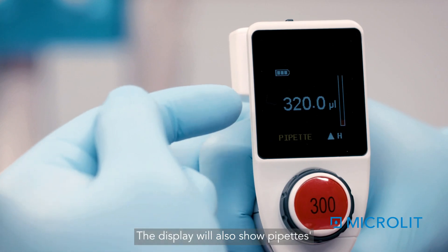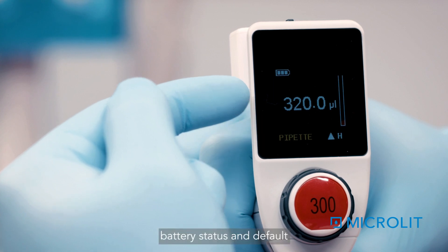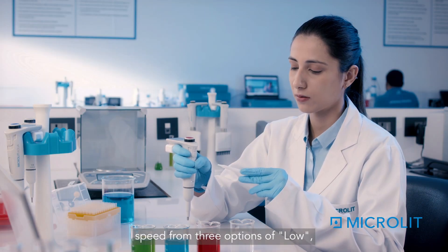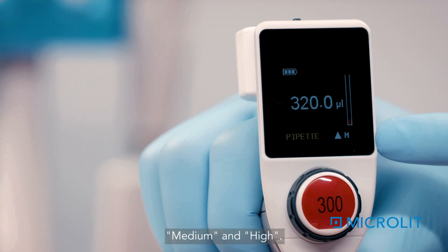The display will also show the pipette's maximum volume capacity, battery status, and the default speed of operation — High. The user can select and adjust the pipetting speed from three options: Low, Medium, and High.